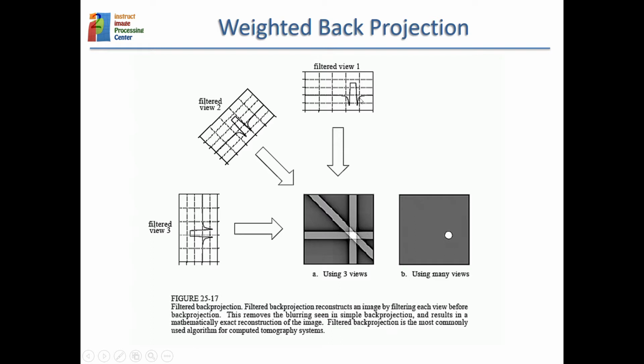And so this process of taking the 1.5 and smearing it along the volume is called back projection. And we could do the back projection of all the other projections that we have. And with only 3, this object is compatible with these 3 measurements.